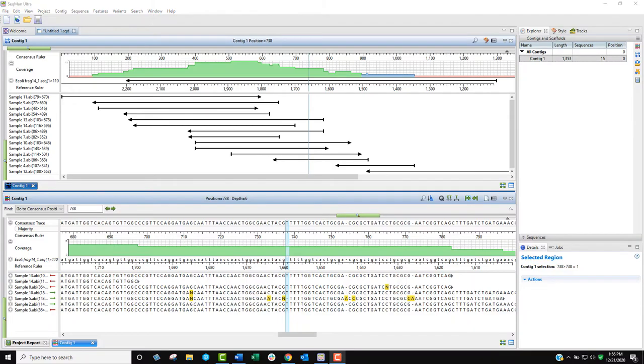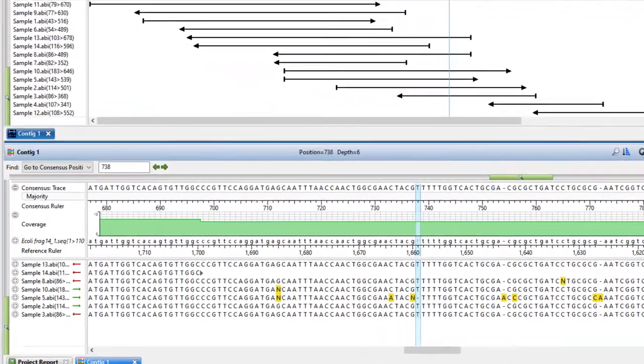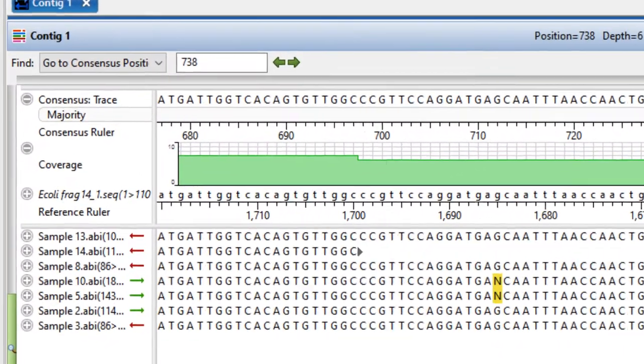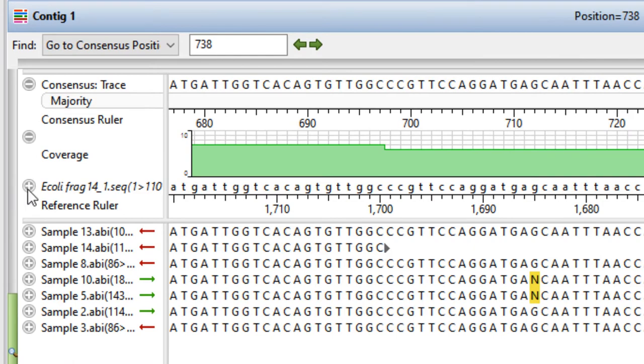To see reference sequence annotations, click the plus sign to the left of the reference sequence in either view.